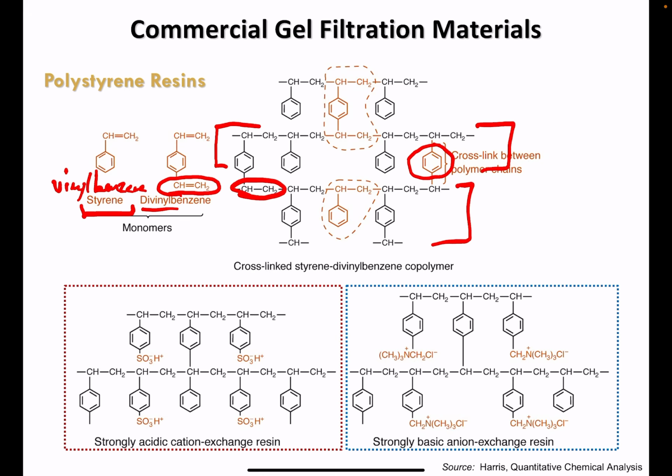There are various materials that are available. The one here is a styrogel comprised of divinyl benzene and styrene. One can actually use a version of that has sulfonate groups that are known and used as strongly acidic cation exchange resins. So the ionic and acid-base properties of the sulfonate group here can be exploited for that application.